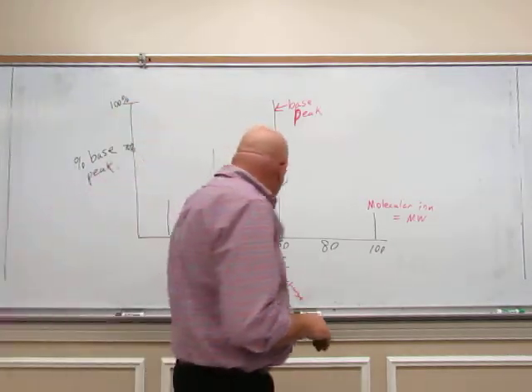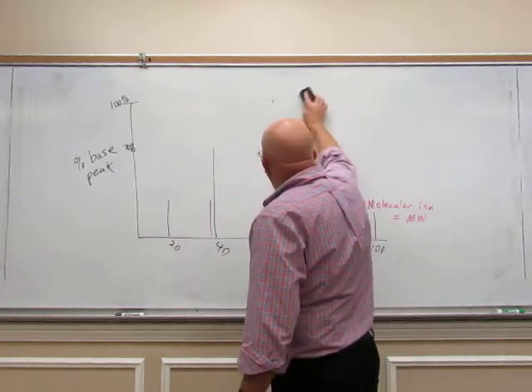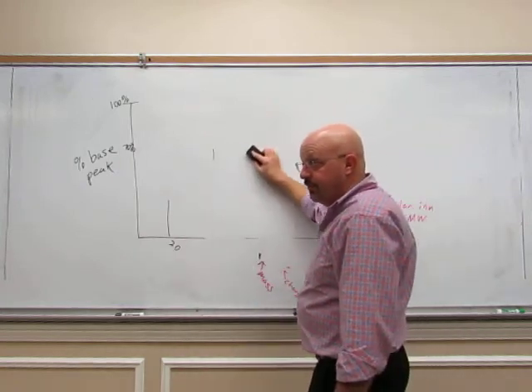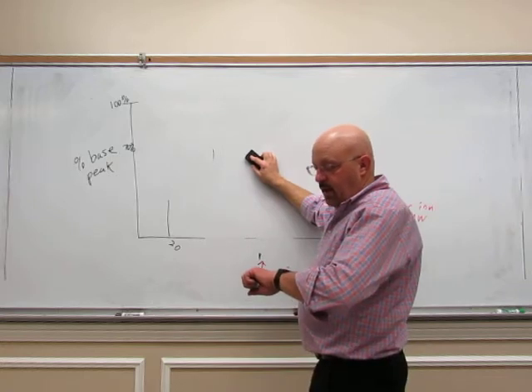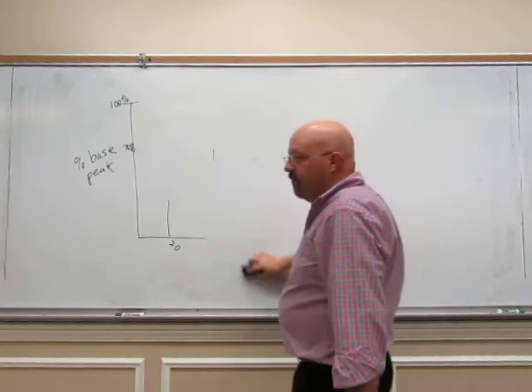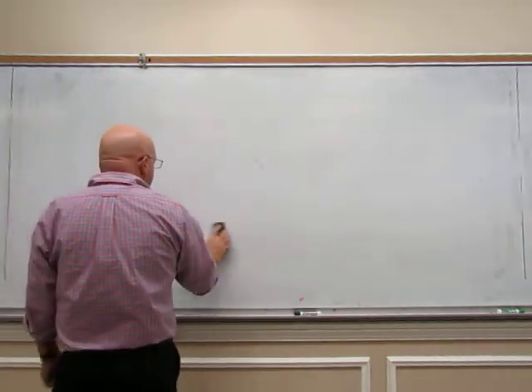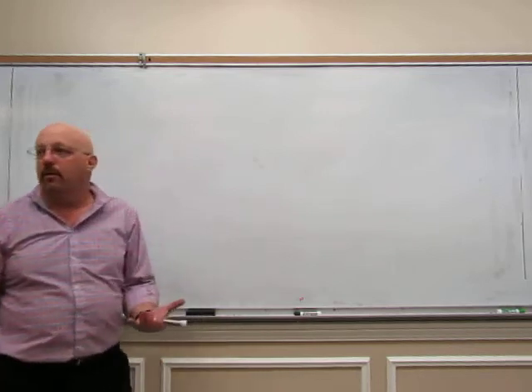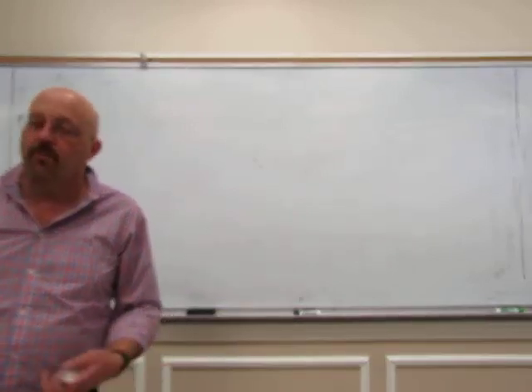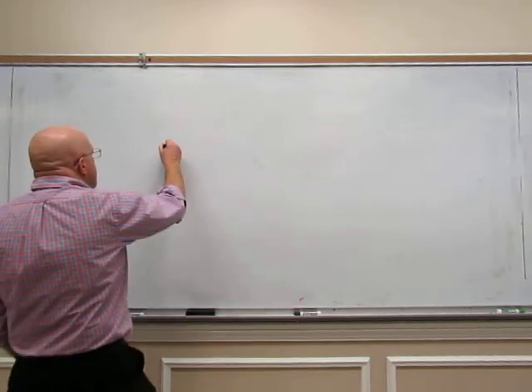Now, before I talk about fragmentation, I want to quickly review. We did this in lecture just last Friday. Let's review real quick the stability of carbocations, because we're dealing with carbocations here. That's what our detector picks up, is carbocations.